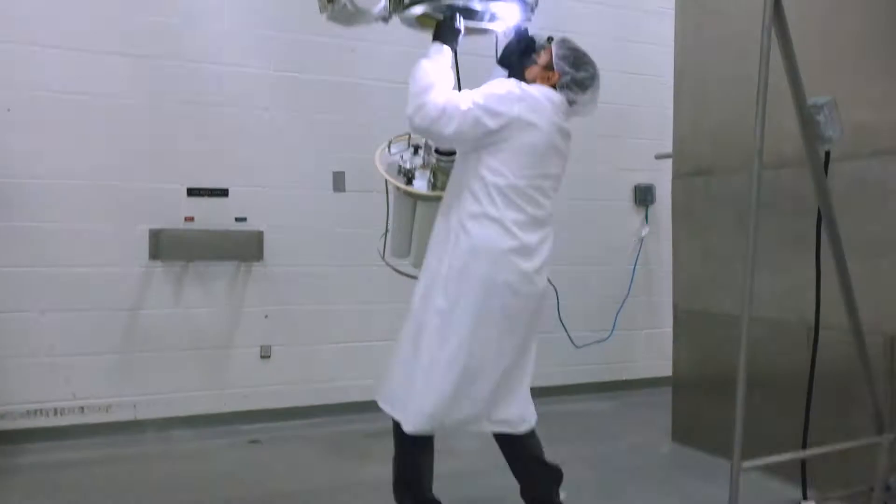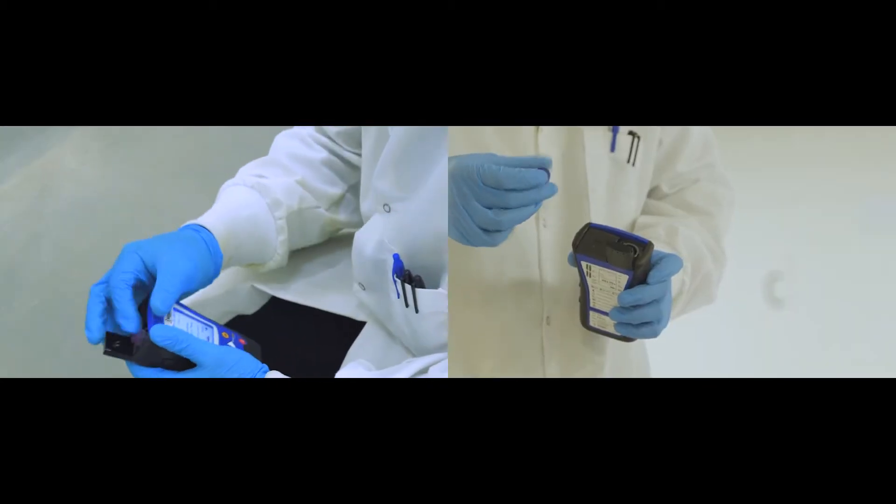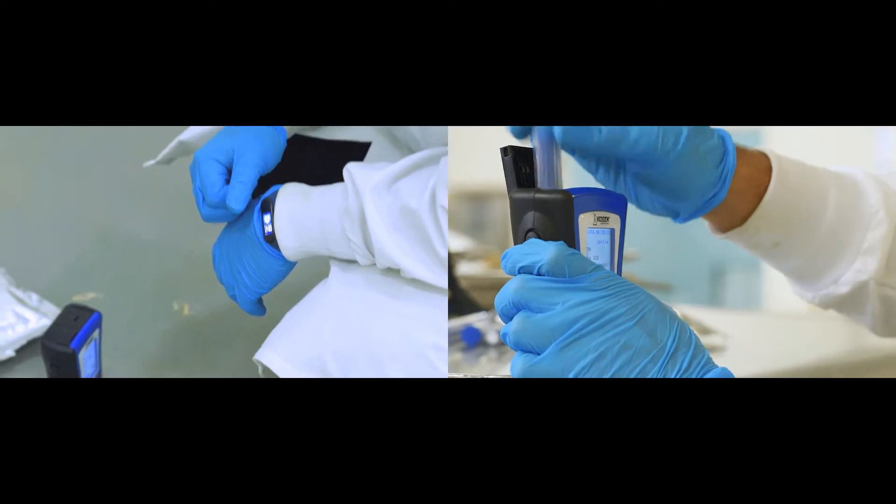the cleaning and sanitation of all equipment is verified by swabbing and testing all surfaces to ensure a sterile environment for production.